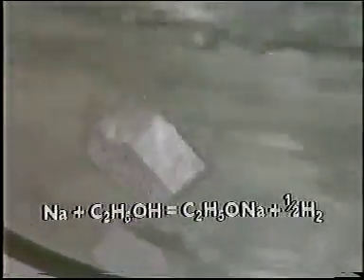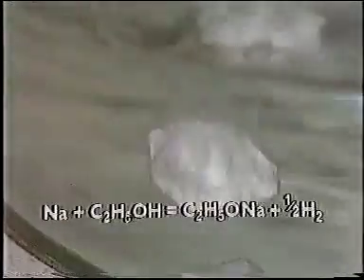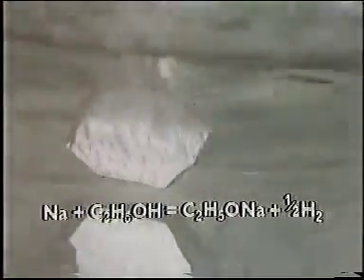Sodium reacts with ethanol to form sodium ethoxide with the evolution of hydrogen. This reaction, as well as being thermodynamically probable, occurs at an observable rate. Now, why should this reaction occur while the decomposition of ethanol, although thermodynamically favourable, does not?